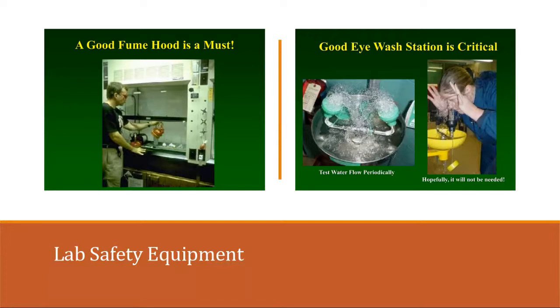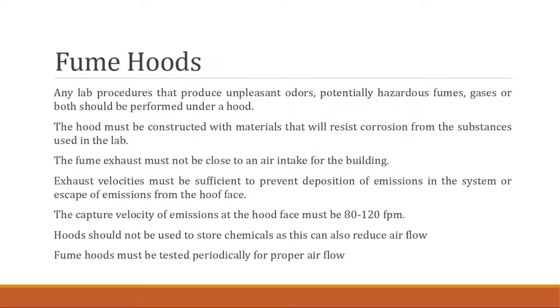The eye wash station has to be flowing periodically. And what's nice about the eye wash and shower stations in our lab is the fact that they are tested frequently just to make sure we don't have buildup and they work properly. Because once again, you just don't know when there will be an accident that happens. Fume hoods.